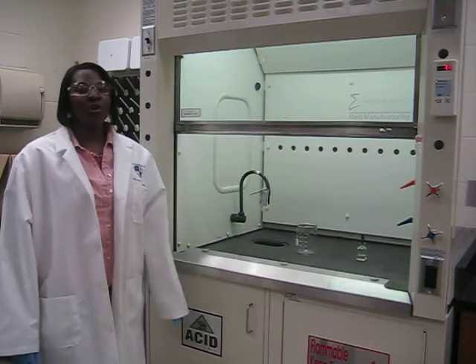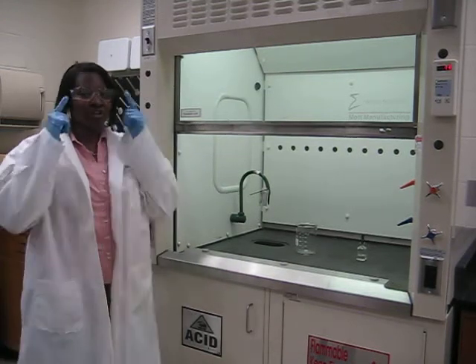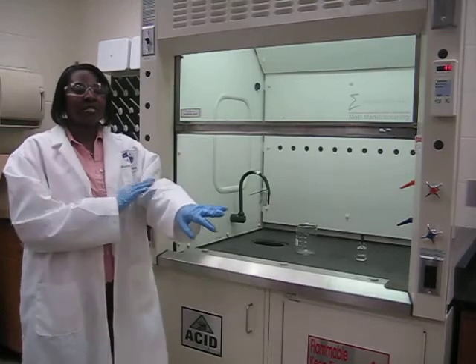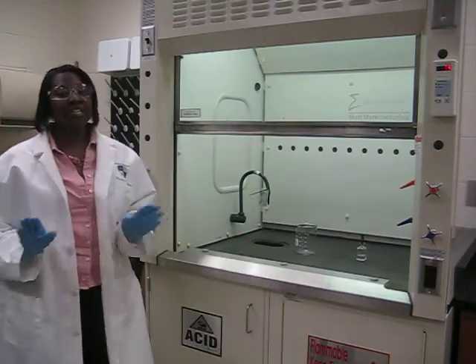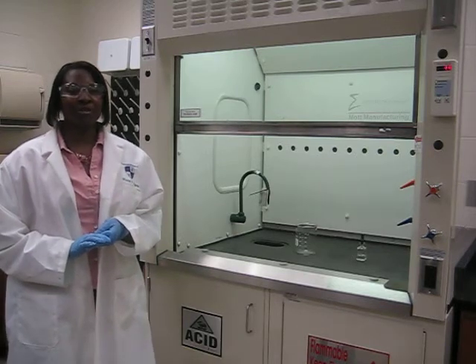Hi, Kathryn here. When working in the labs, make sure that you're wearing your safety glasses, gloves, something that covers your skin, and shoes that completely cover your feet, even if they don't match the fabulous outfit that you picked out this morning.